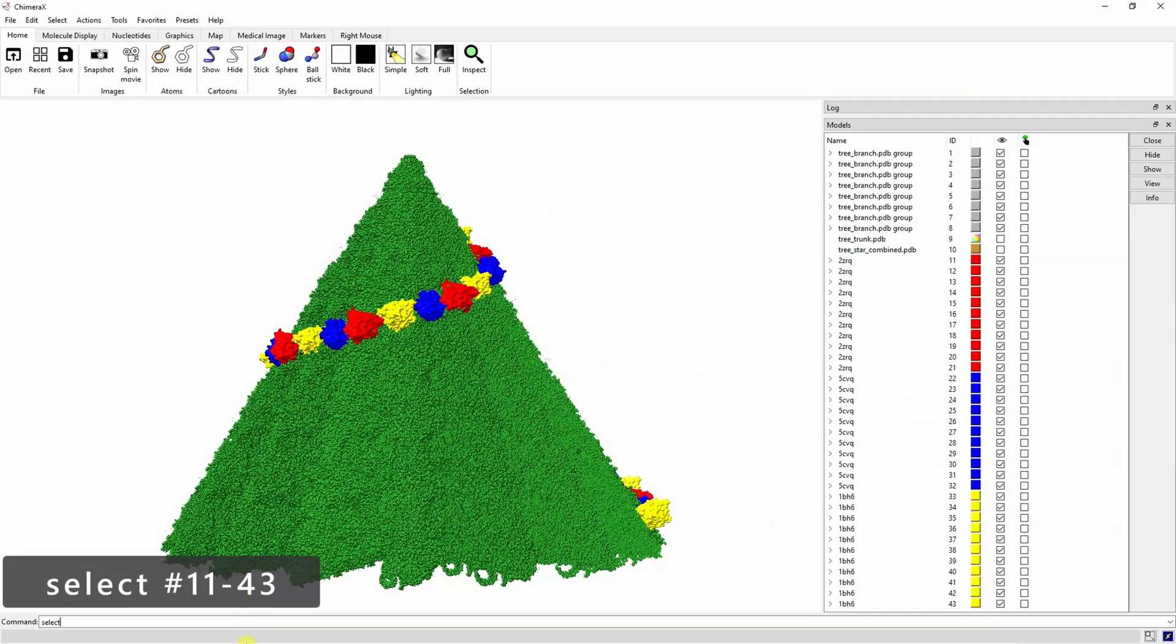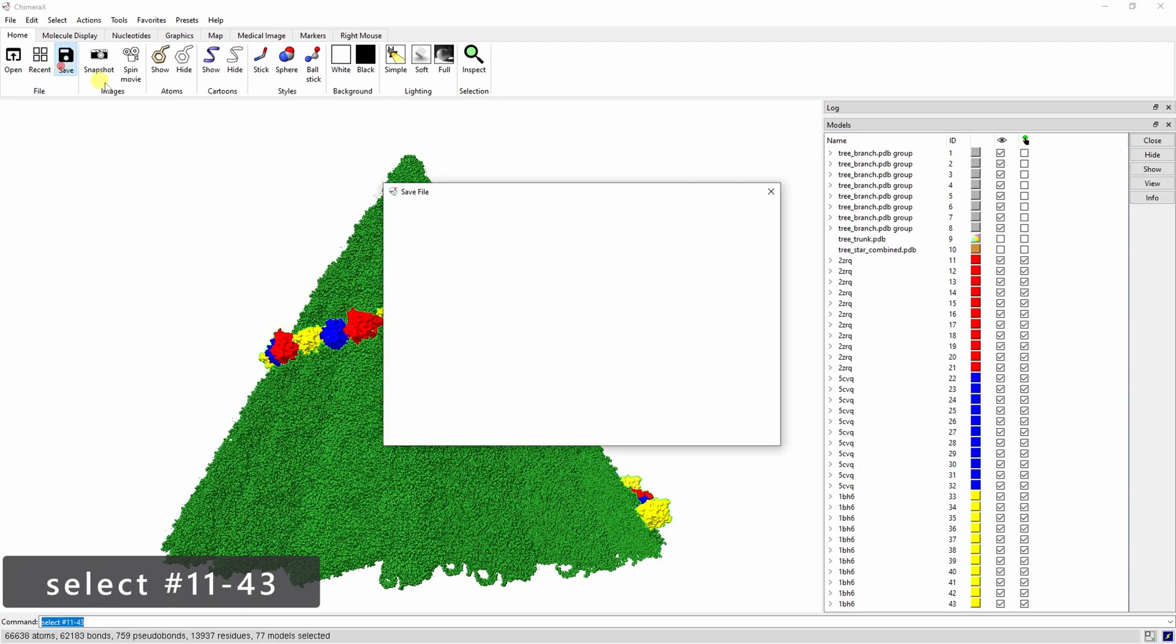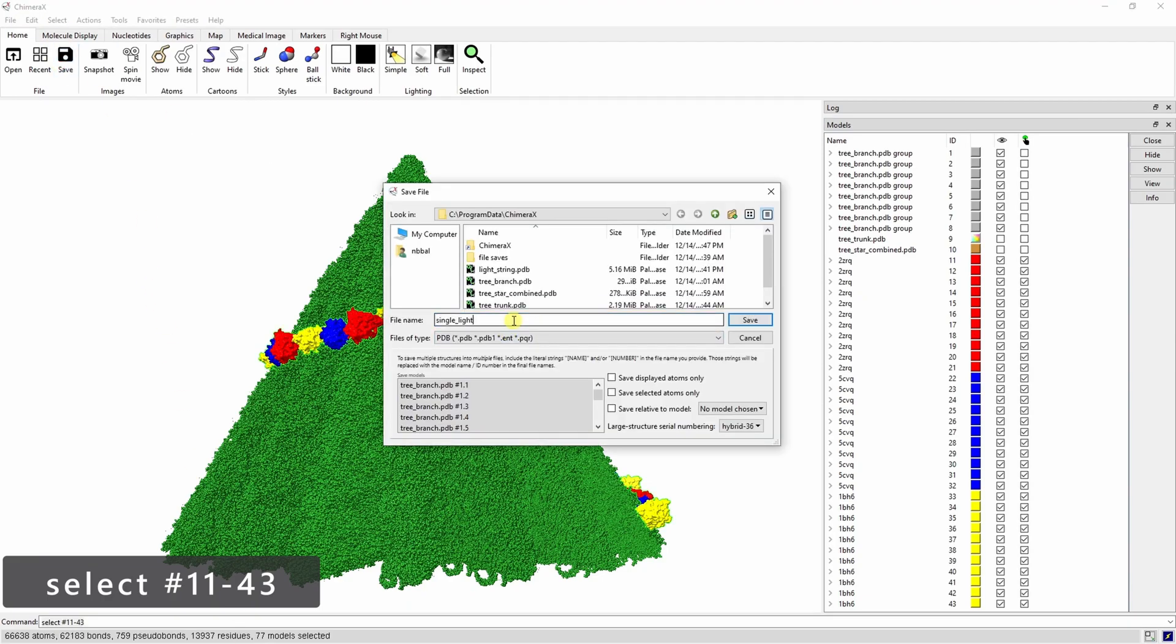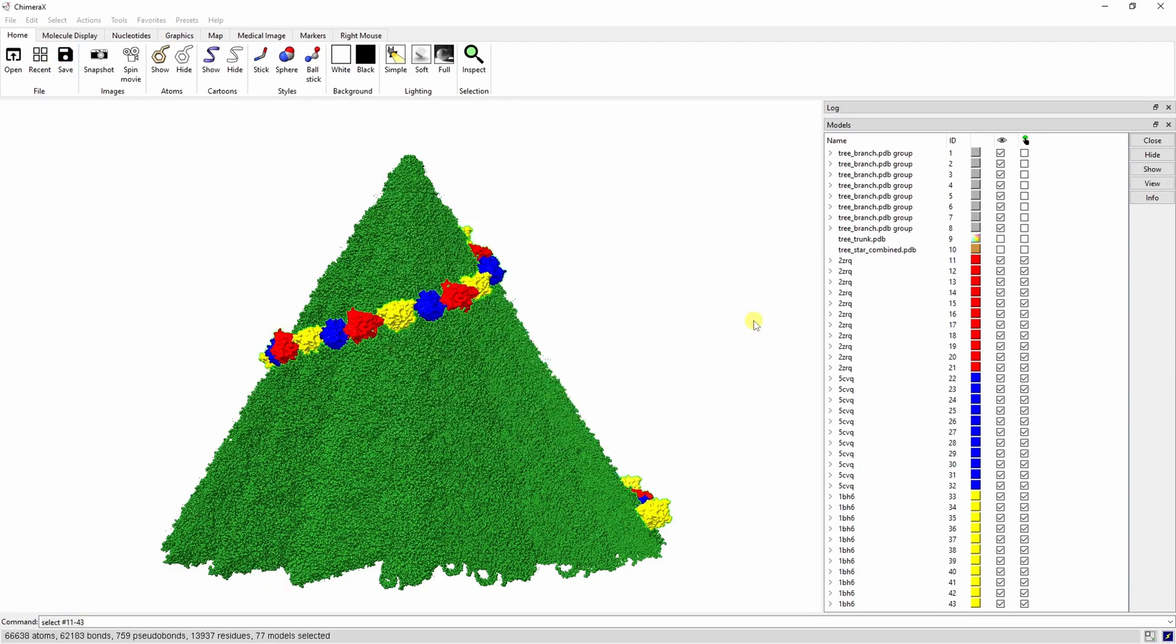Once you're happy with how they look, select all the small proteins and save them as a PDB, making sure you check the Save Selected Atoms Only button.